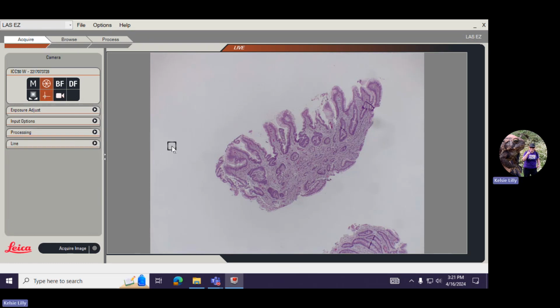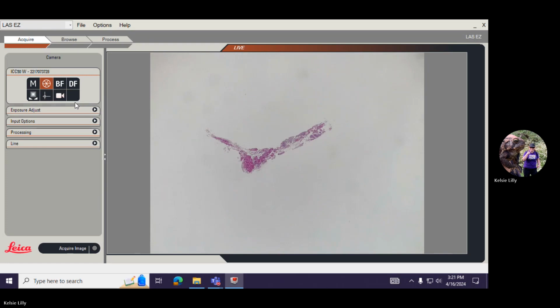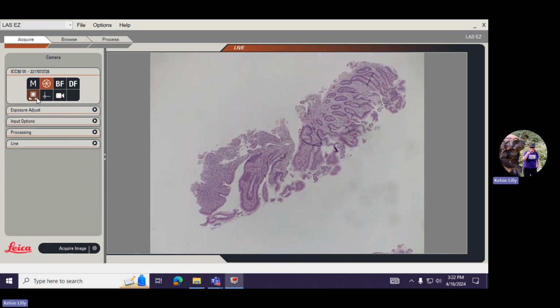White balance. So I'm going to deliberately mess up the colors here. If your colors are strange like this with this greenish tint, you can select this button right here, click on the background, and your colors are going to be reset so everything looks nice and normal. You could also do it with the entire screen. If you have nothing but background, press that button right there. So your white balance has been set. So now you have the proper colors right here.